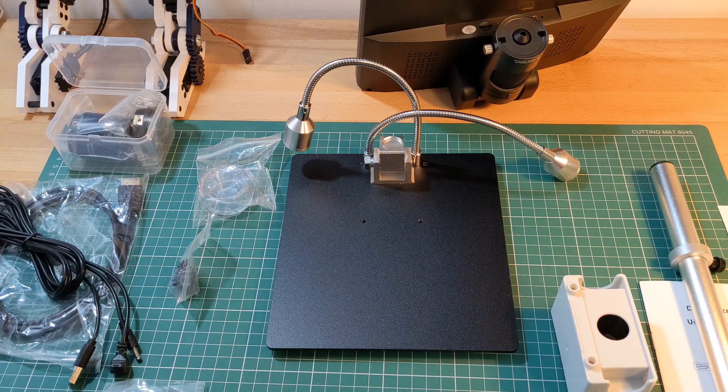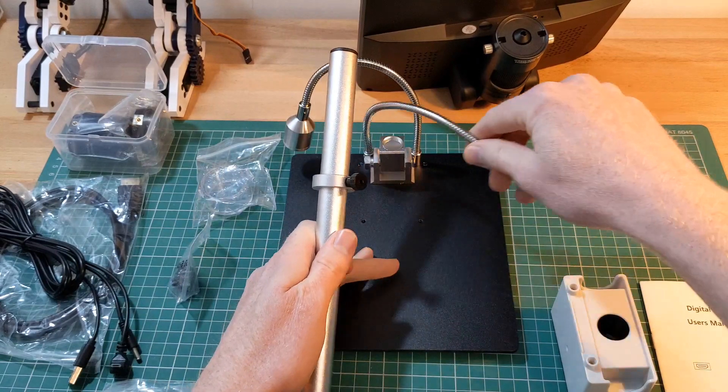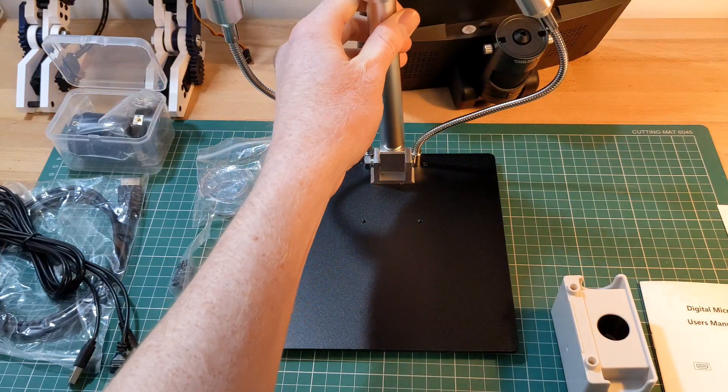Assembling the microscope is simple and only takes a few minutes. The instructions are clear and easy to follow. First we take the support arm and screw this directly into the base platform. The screw fit is good and feels secure.